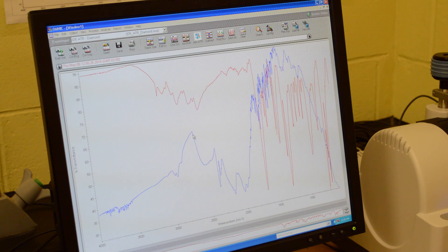You'll want to begin by removing your background. You can click on any line of that spectra, it will highlight in red, and then you can press clear up here.